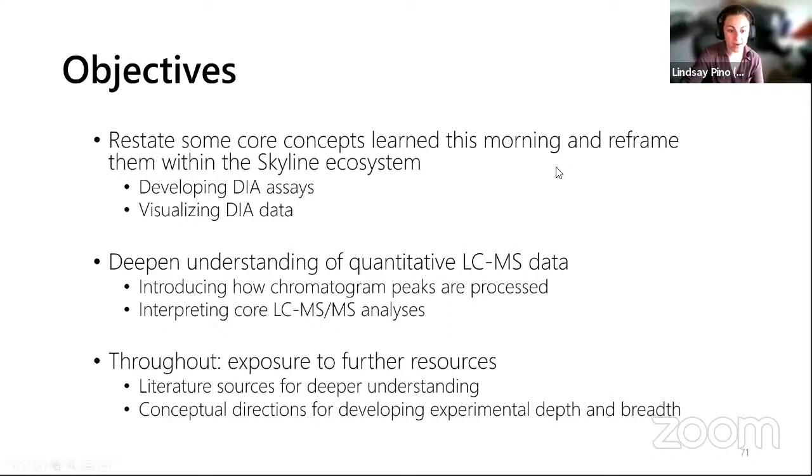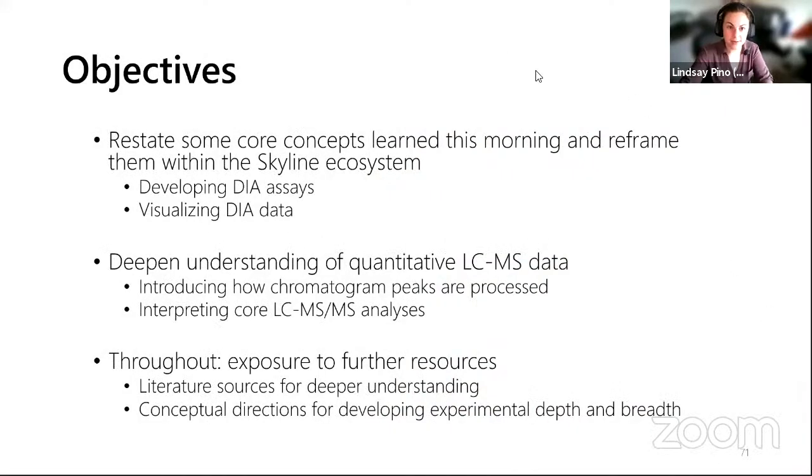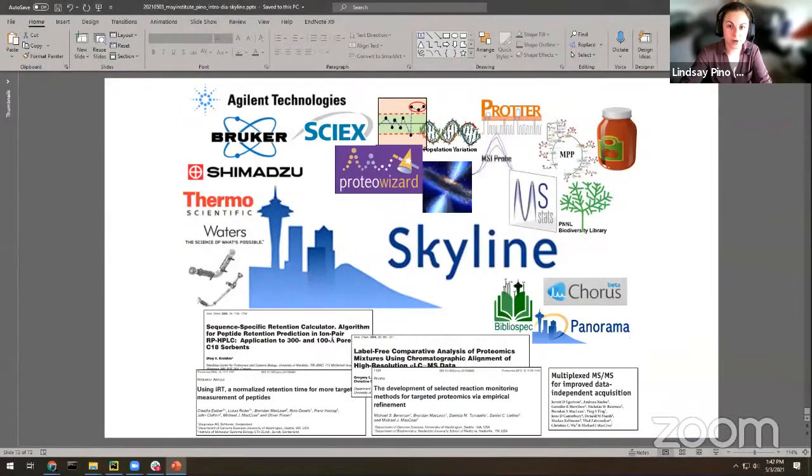And the main takeaway message: let's now try to apply some of these things in Skyline. While I get that booted up, thanks to the TAs and Brian for getting to a whole bunch of the questions. I'm going to get Skyline booted up now. So I'm just going to open up Skyline.